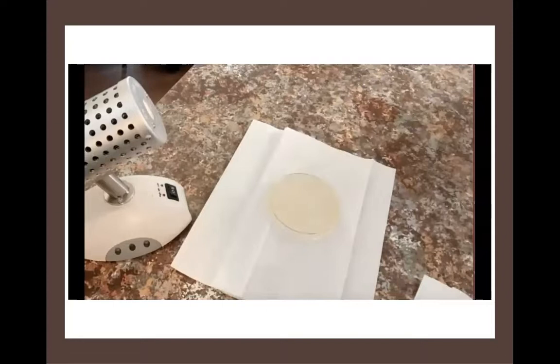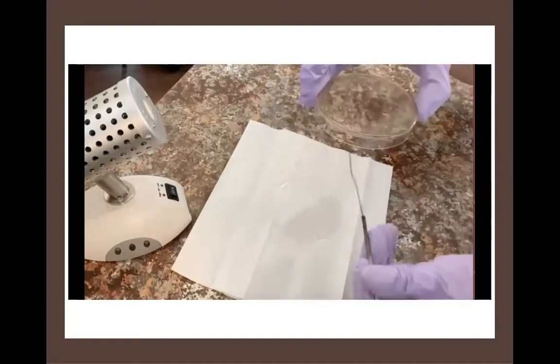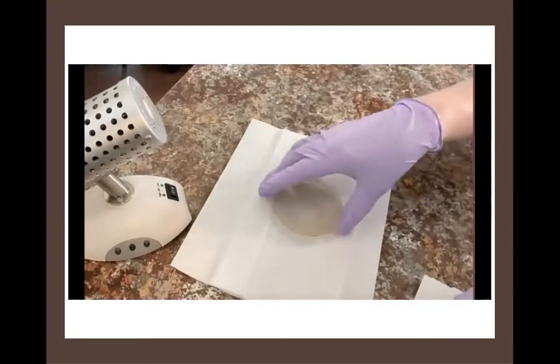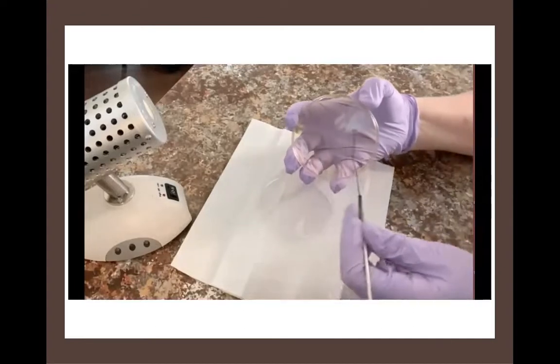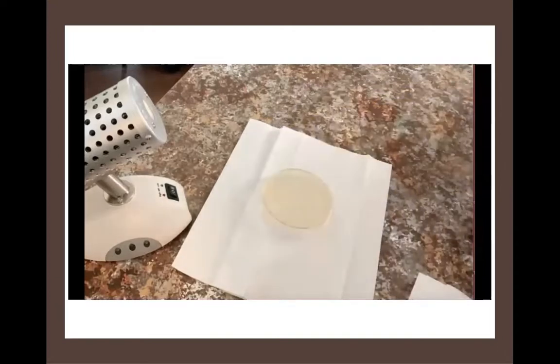You also don't want to do the other extreme, which is keeping it completely upside down and trying to inoculate it. You will push your loop into that agar if you do that. What you want to do is open up the plate and hold it at an angle like this. You can get access to the surface. You can get your streaking done. Get the plate closed. You're good to go.